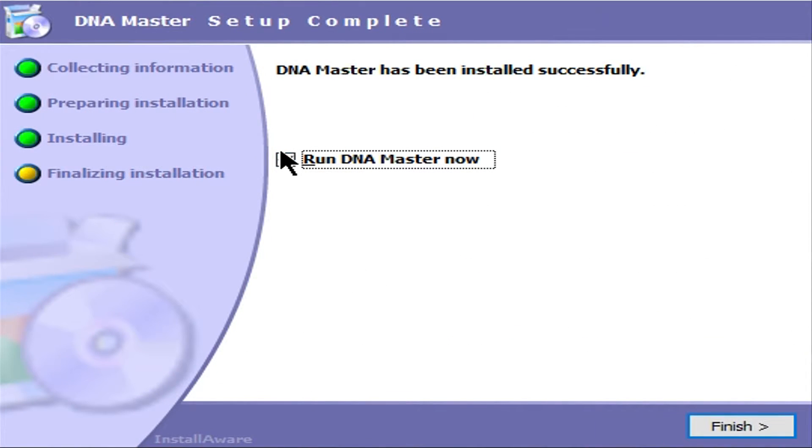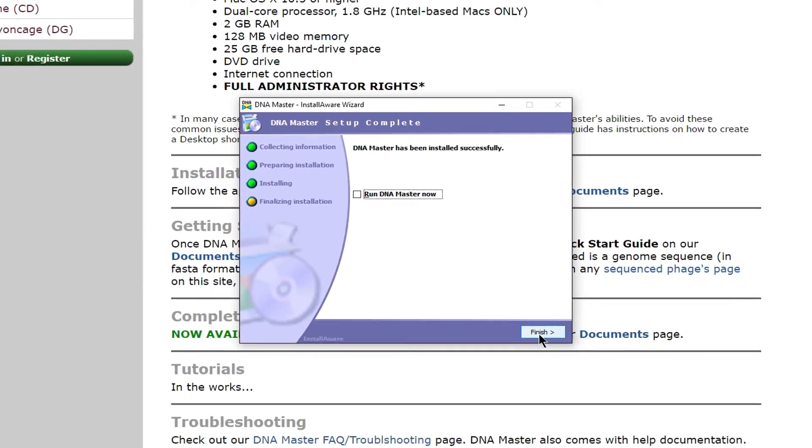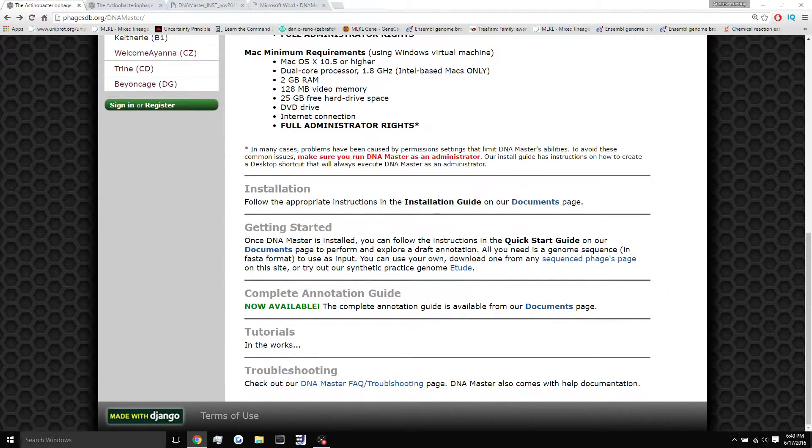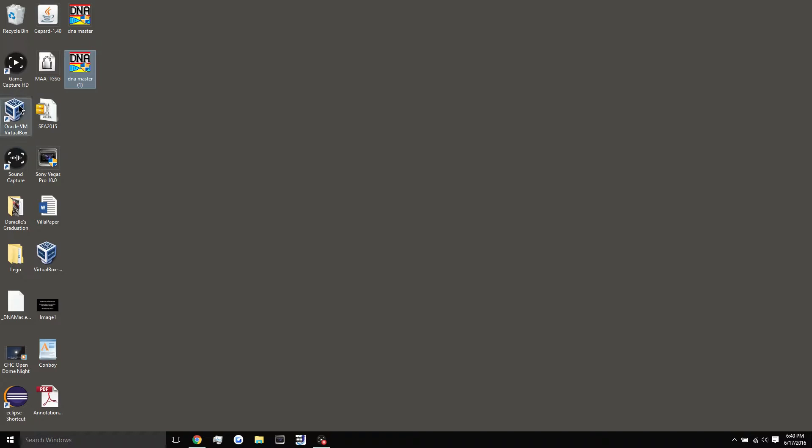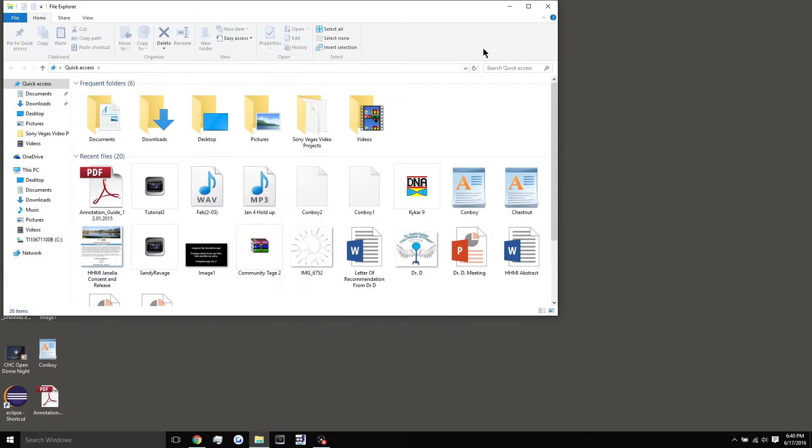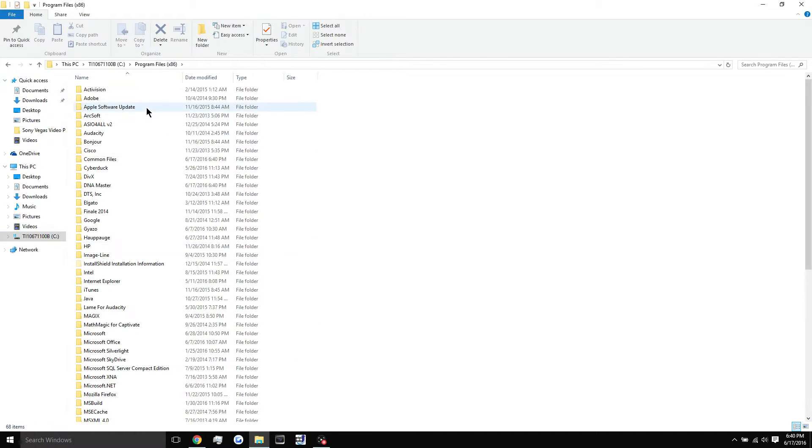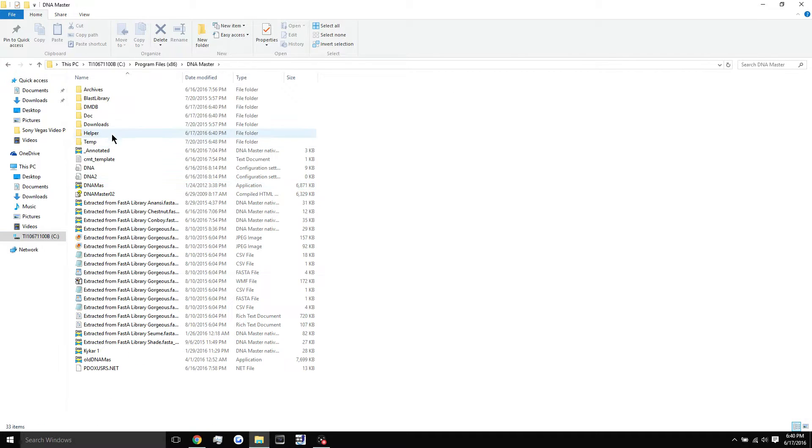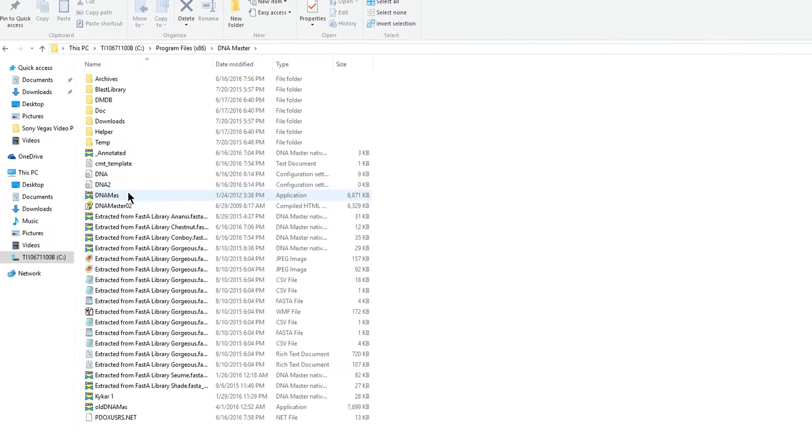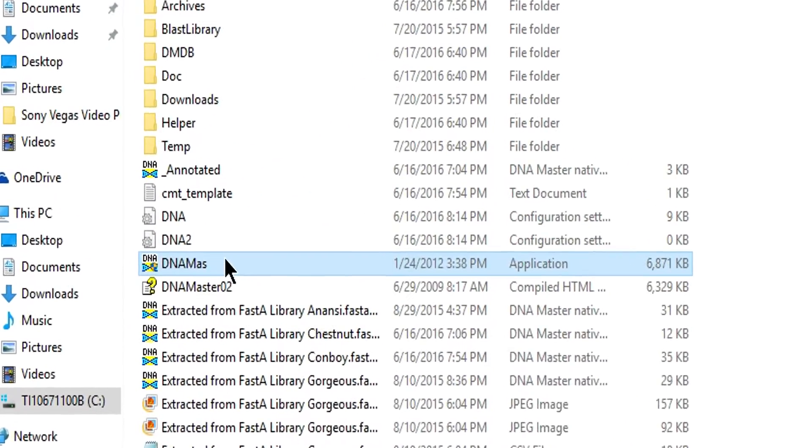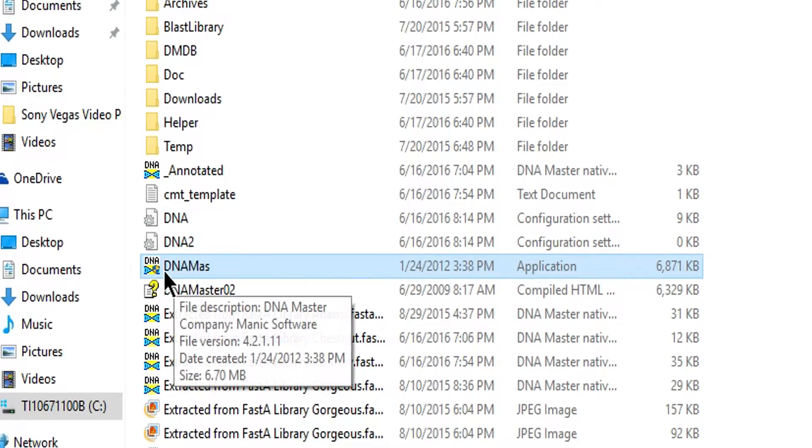All right, we're going to uncheck run DNA master now and just hit finish. The next thing you want to do is head to the path that it just created. So you're going to go into your, most likely your C drive, program files, x86, DNA master, and you're going to find the DNA mass application.